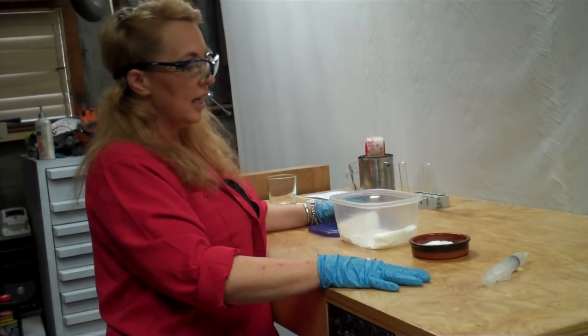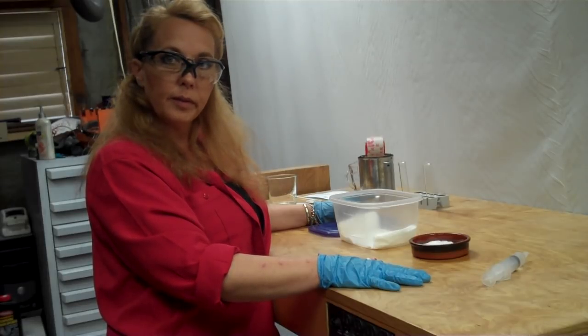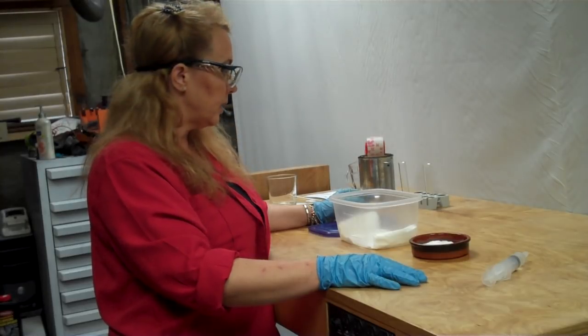Hi professor, this is Denise Baker and I'm going to do the super glue fuming experiment here at home. I had all the supplies so I thought I would give it a try and see just how well it worked.